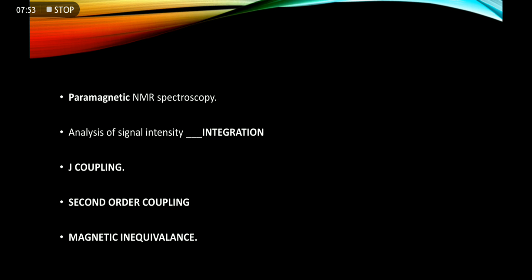For a proton, the local magnetic field is slightly different depending on whether an adjacent nucleus points towards or against the spectrometer magnetic field, which gives rise to two signals per proton instead of one. These splitting patterns can be complex or simple and can likewise be straightforwardly interpreted.